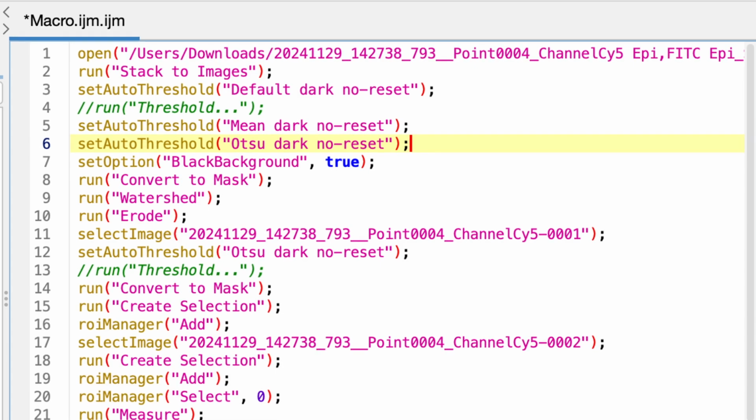Later, we tried to make it a little bit more objective, and that's why we employed a script for ImageJ. This script is obviously a little bit more objective, since you already have imaged certain situations, but the script employs one more level of analysis, where it is more objective because it employs thresholding, and thresholding on the image based on the intensity of what we are imaging is more objective than our eyes. Yeah, that makes a lot of sense.